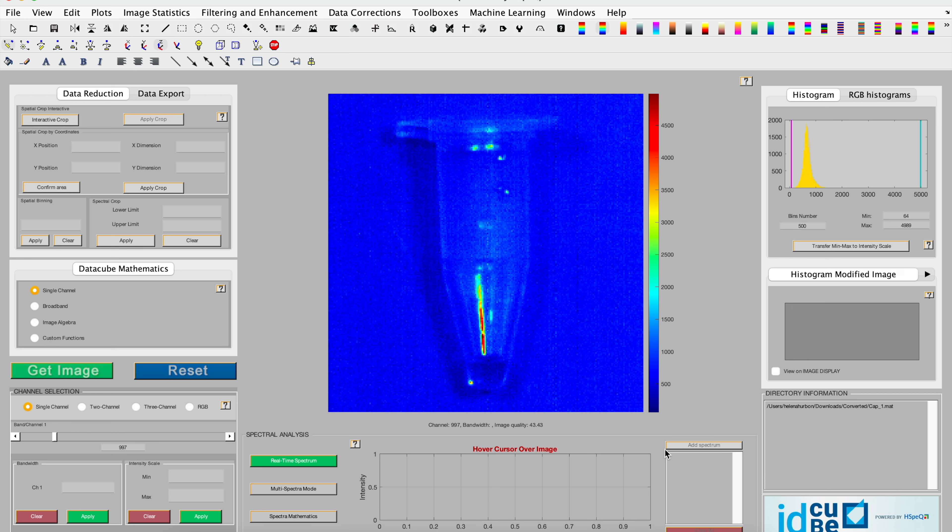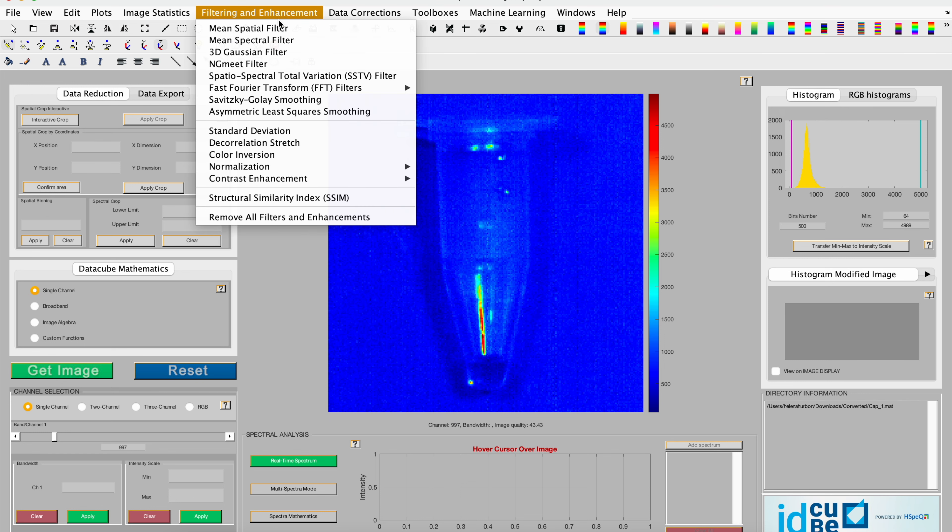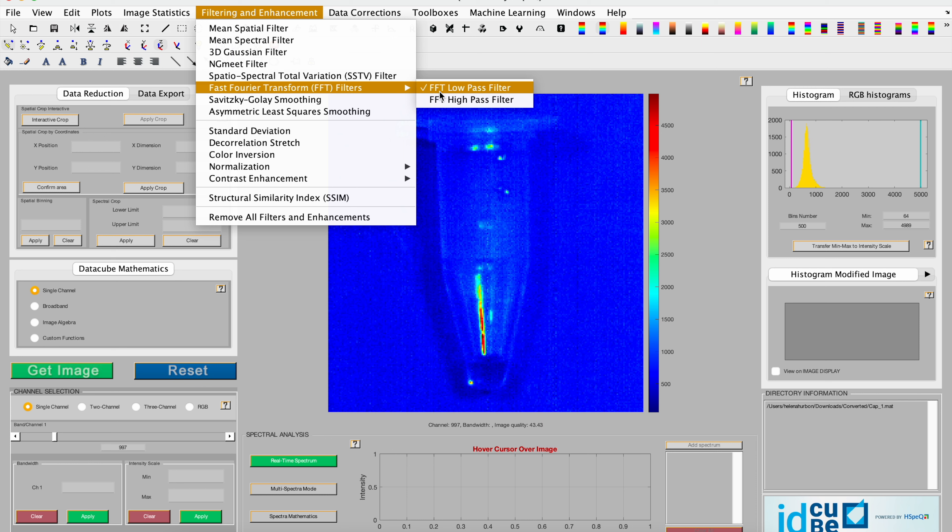To start, you'll want to load the file, and then go to filtering and enhancement, go to the fast Fourier transform or FFT filters, and select the low-pass filter.